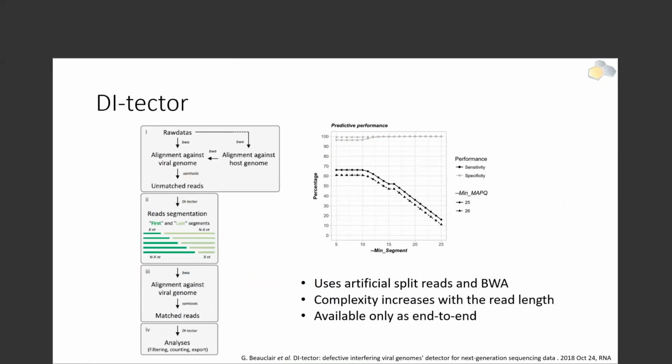I don't think that's really worth getting into the technical details here. I just want to bring it up because I found it an interesting approach and it highlights the difference between approaches within HIVE and approaches outside of a unified environment. I'm guessing the reason was that the available tools to that group did not have the flexibility of having their own aligner.